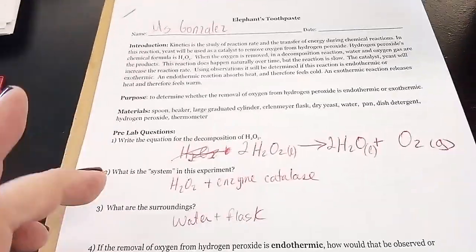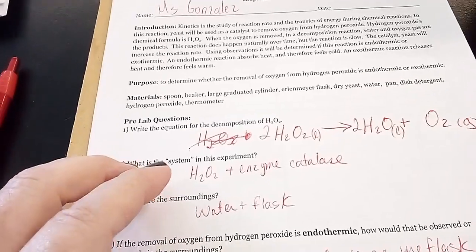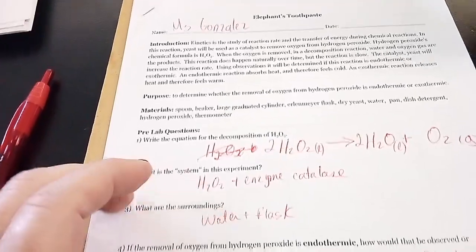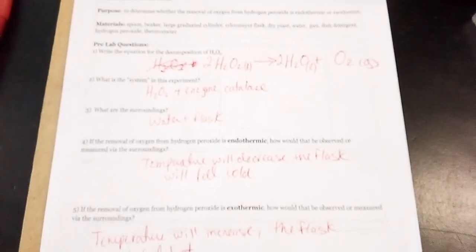Now the system of this experiment we're going to be looking at is hydrogen peroxide and the enzyme catalase. So this is my system, hydrogen peroxide. The surroundings are going to be the water that surrounds the molecules of hydrogen peroxide, and the flask. And we're going to measure the temperature of the water and the flask.